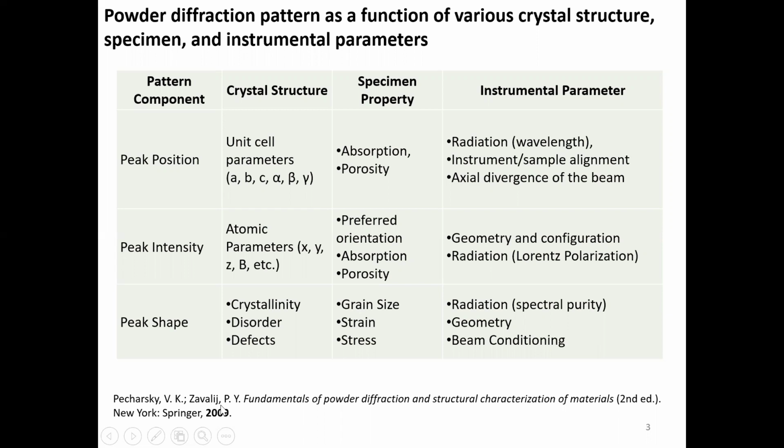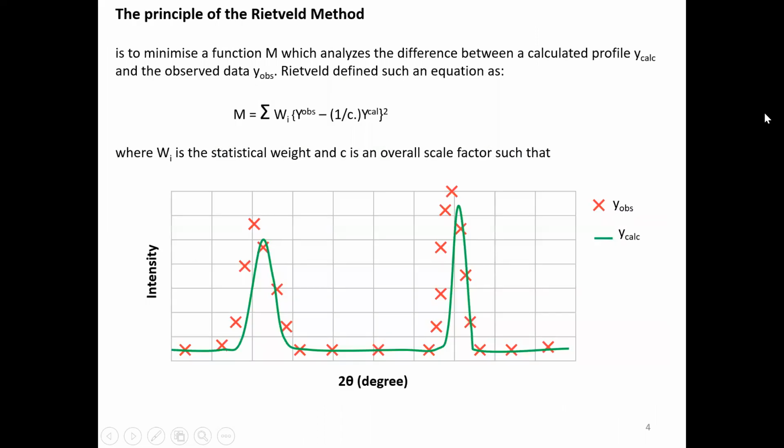So the principle of the Rietveld refinement method is based upon the least square method. In this schematic I have shown that the red crosses are the experimental data.